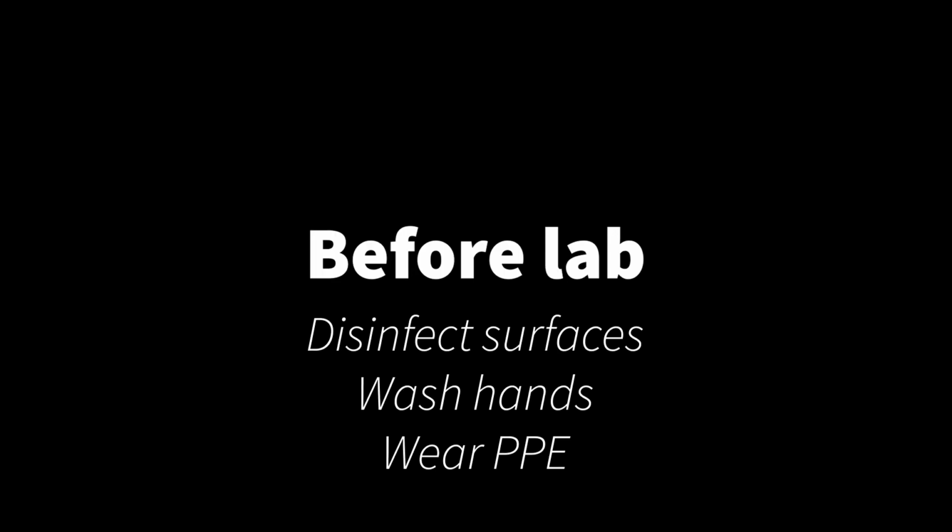Before you start the lab, you'll want to disinfect all surfaces, wash your hands, and of course wear all the appropriate personal protective equipment that we've described previously.